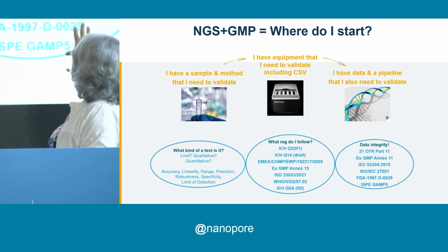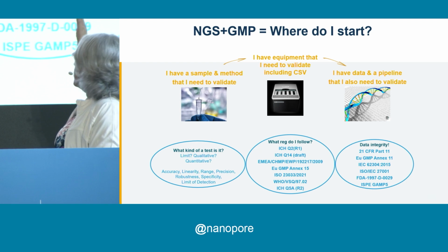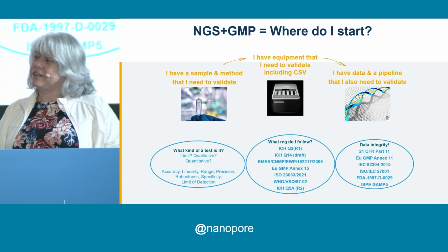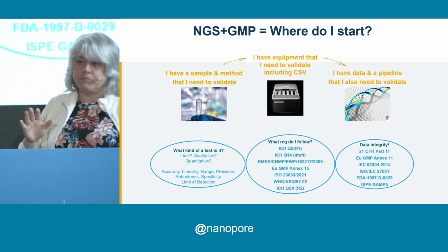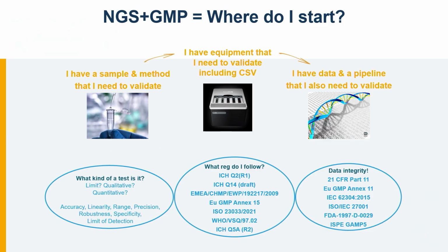And then, of course, the biggest consideration in the field of sequencing is, of course, you have massive amounts of data. What are you going to do with it? How do you maintain integrity, security? How do you move it to the cloud or not? Can you use cloud-based resources? You can in the US, no problem. In Europe, they're a little bit more fidgety about these things. They don't like that very much. There's all your GAMP requirements. Again, there's just a number of requirements that you have to think about that go into all of this.